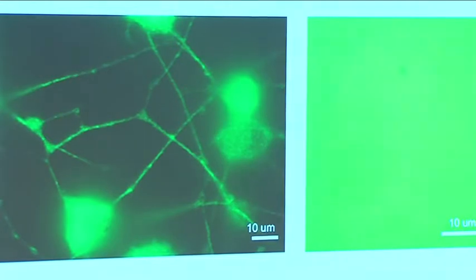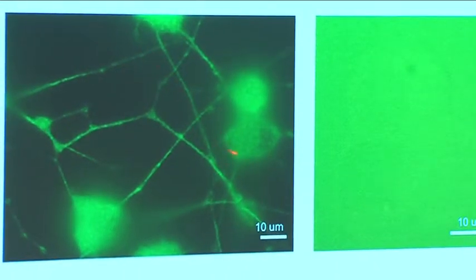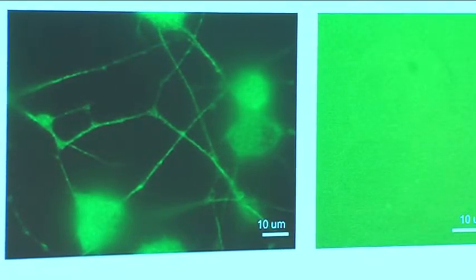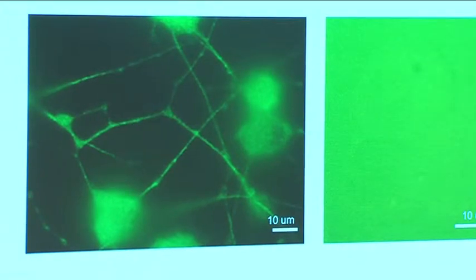What is shown here is the PC12 cells, and after they are induced by nerve growth factor, they grow neuron axon-like structures, though not exactly an axon. The first thing in the strategy we took is, we decided the most quote-unquote direct way is to inject, right? You couldn't be better than that. You directly inject the quantum dot in and you get it. And it turns out that took much longer than we expected.